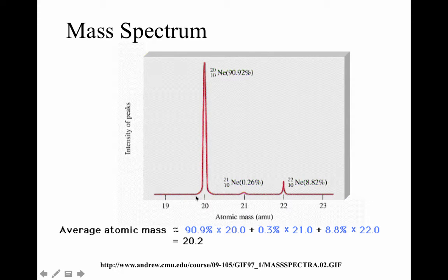Reviewing a little further still, just looking at isotopes. Neon has 3 isotopes. And when it is put through the mass spec, the neon is hit with that high energy electron, and it forms positive neon isotopes. And those isotopes get deflected around a bend, and then it's detected at the end.